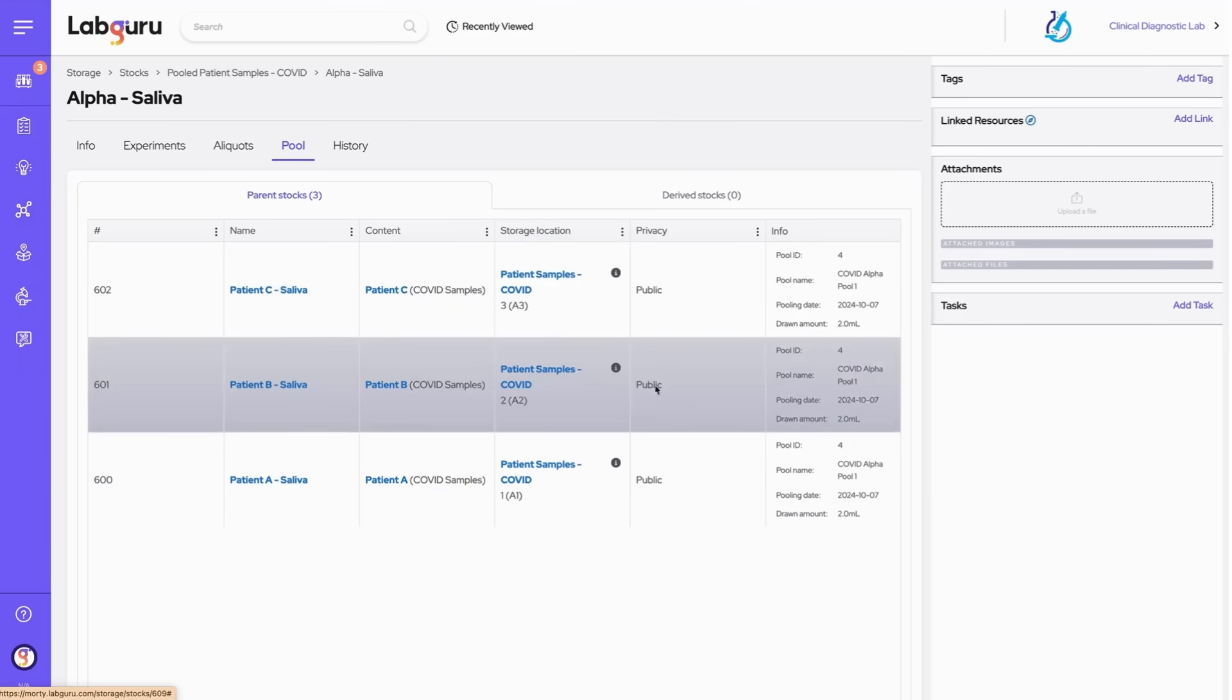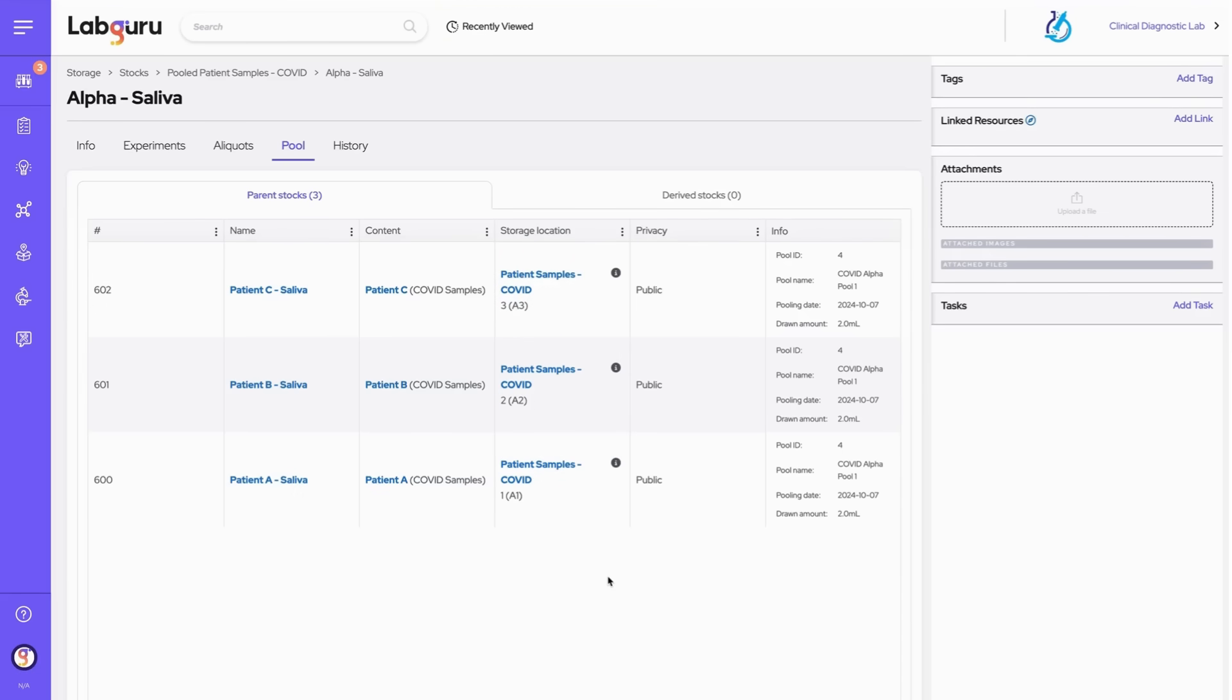Here we see each individual patient sample, the volume taken from each, and the name of the pooling event, all clearly displayed. In the derived stock tab, we can track whether this pooled sample has been part of other processes, ensuring complete traceability.